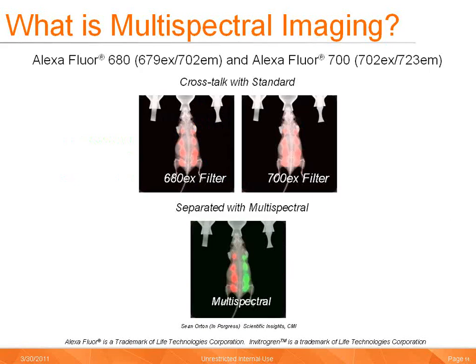Here we will use imaging of two fluorophores, Alexa 680 and Alexa 700, in the same sample to illustrate the second utility — multiplexing of multispectral imaging. Alexa 680 was administered subcutaneously in a dilution series along the right flank of an animal, and Alexa 700 was administered subcutaneously in a dilution series along the left flank. The sample was imaged using standard imaging, first for Alexa 680 and then for Alexa 700. There is significant crosstalk in the images, making it impossible to distinguish the signals. Below, the sample was imaged using multispectral imaging with multiple excitation filters and a single emission filter, achieving a separation of the signals.